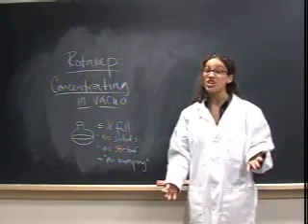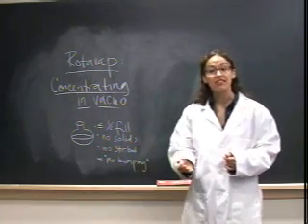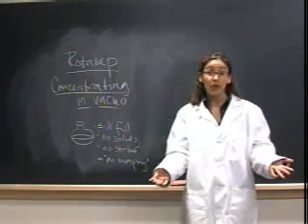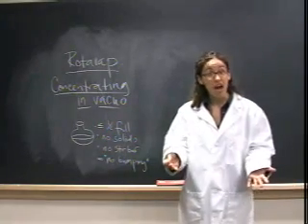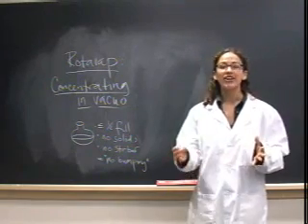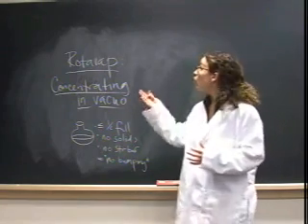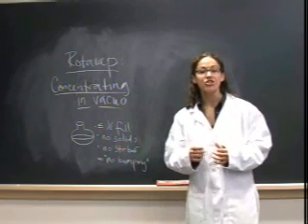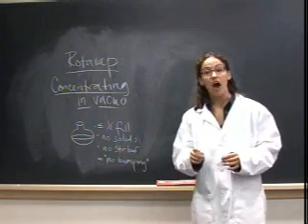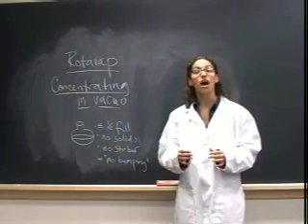Whether you are dealing with a solid, an oil, or a liquid, at some stage you will have to dissolve it in a solvent. Whether you need it as a solution so that you can run a reaction, or perhaps a chromatographic purification, when you're done, you will need to remove the solvent in order to isolate the pure compound. Luckily, a very useful piece of laboratory equipment called a rotary evaporator, or a Rotavap, was designed for just this use. While Rotavaps are very easy to use, there are a few general rules of operation that you will need to follow. This video will demonstrate the correct use of a Rotavap.